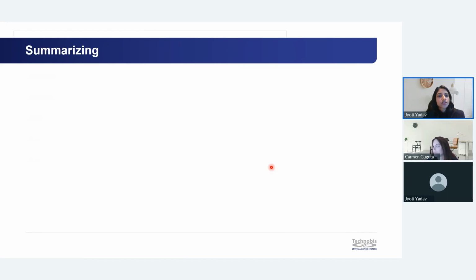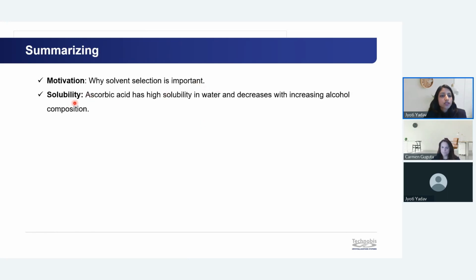And with this, we will summarize our webinar. First, we saw the motivation behind this work, that is, why solvent selection is important. Then we saw the solubility, how to perform the solubility experiments using the Crystal16 instrument, and we saw ascorbic acid has high solubility in water, which decreases with increasing alcohol composition. Then we went through the basics of nucleation and discussed what nucleation is, different types of nucleation, and different methods to determine nucleation kinetics.